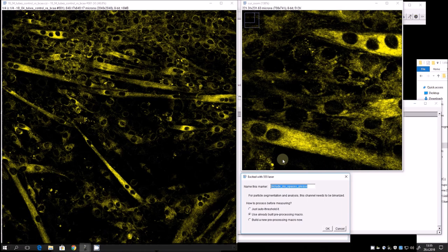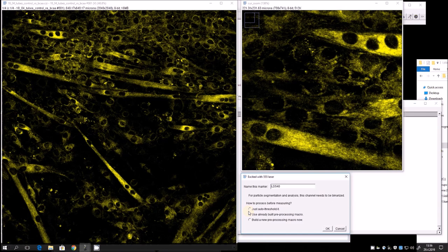The program will open the first image and the first channel, telling you with what laser it has been excited. You should insert the channel name here for future variable naming purposes. In our case, we are marking neutral lipids with LD540. You are given three choices: auto-threshold it using ImageJ's automatic threshold, use an already-built macro for this specific channel — which I recommend — or build a new one. This macro is used for binarization to count and measure the number and size of objects.